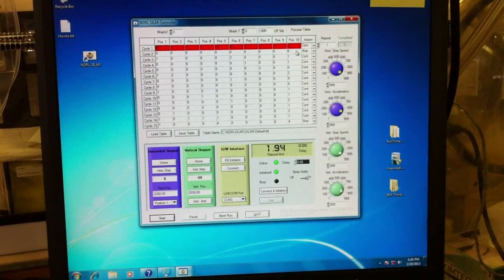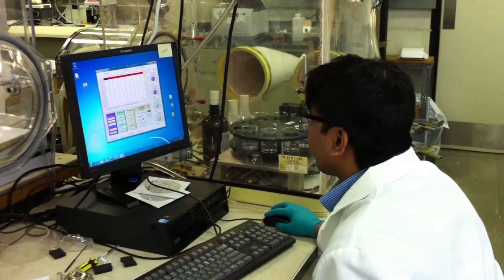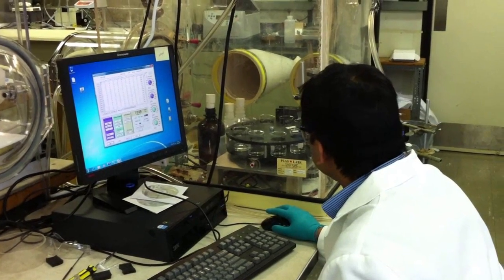Using custom-built instruments and software developed in our lab, we've automated this process to increase our solar cell throughput.